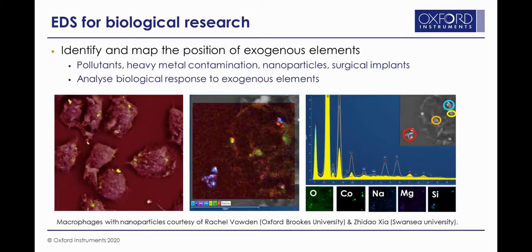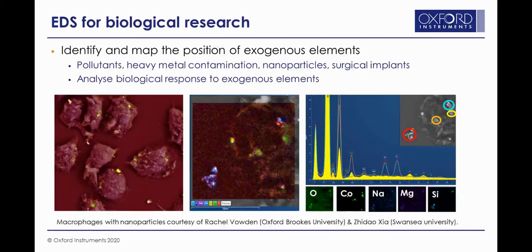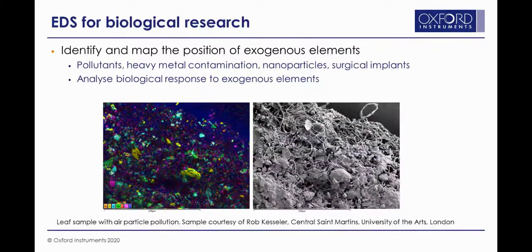It is also possible to identify and measure exogenous elements — things found in biological tissue but originating outside of it — including pollutants, heavy metal contamination, nanoparticles, and surgical implants. Here we have an example of macrophages exposed to cobalt nanoparticles, where EDS identifies the cobalt nanoparticles as distinct from other regions with an equally bright backscattered electron signal, which are actually composed of sodium and silicon. A second example shows particles from air pollution deposited onto the surface of a leaf, collected by collaborator Rob Kessler, demonstrating how EDS can easily identify the composition of pollutant particles on the leaf surface.